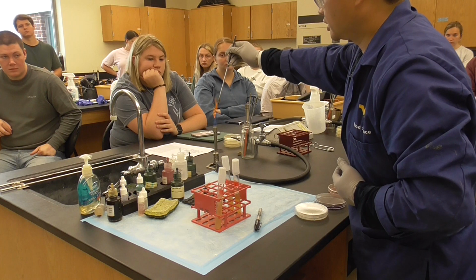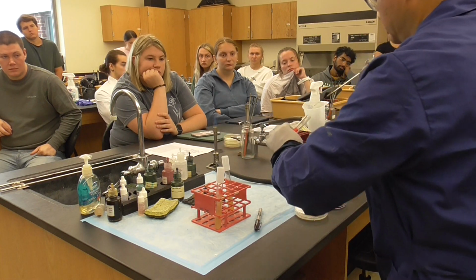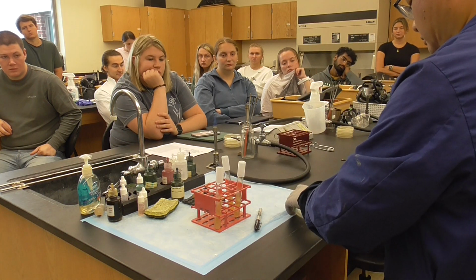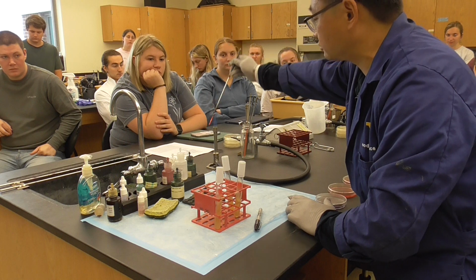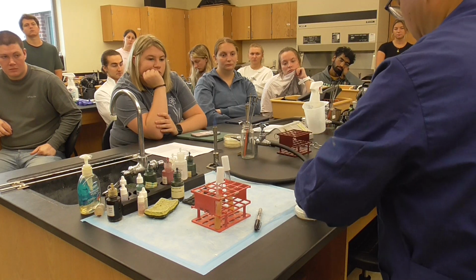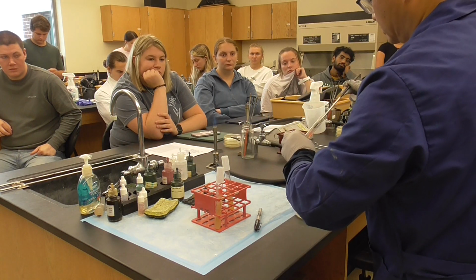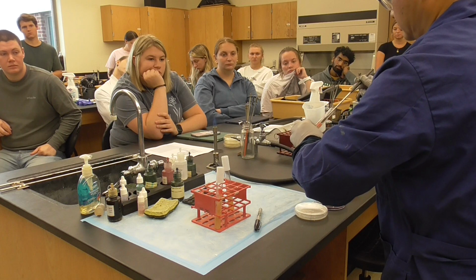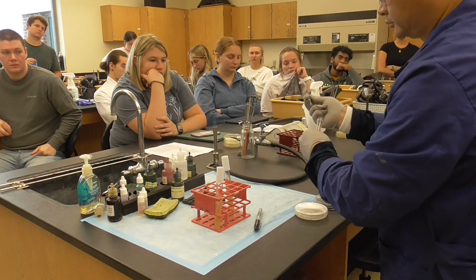Flame the loop. You need to know it's in the order. Okay, what's the circle you have? Okay. Lactobacillus right there. Flame the loop. Go down to your Lactobacillus. A little bit. You can skip the flame or you can flame, it's up to you. I think it's really light, so. Go down. Right here. Okay, recover. Flame the loop. You pick a little bit. Right here. Flame the loop. Pick a little bit. Right here. Okay. Done.